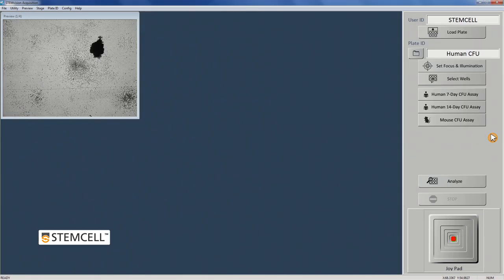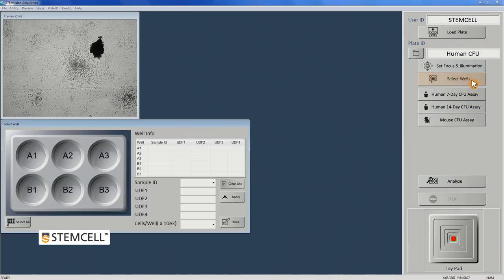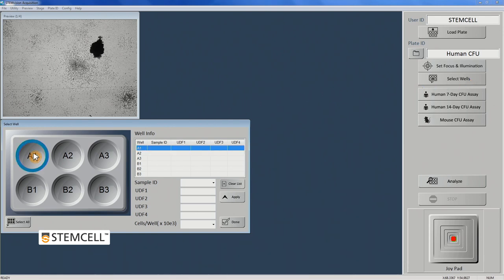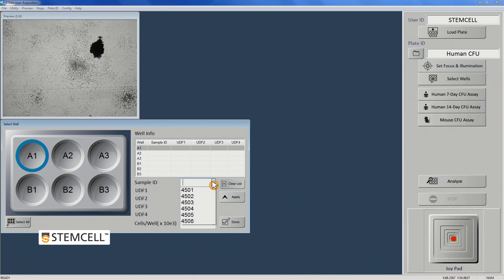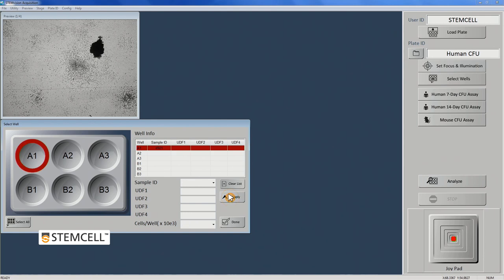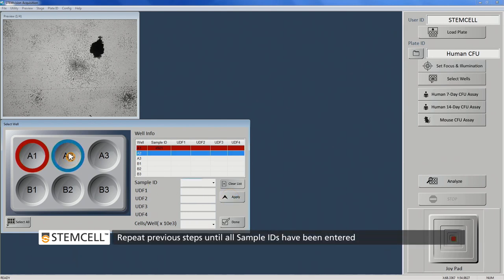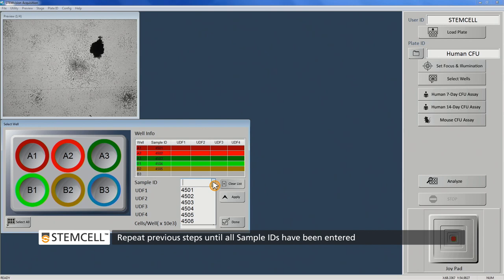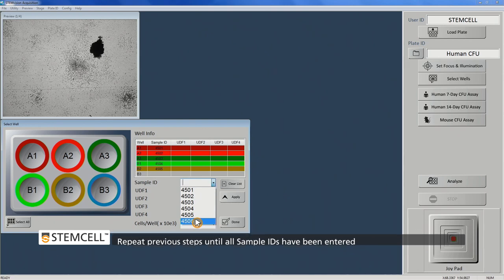Once the sample has been properly positioned, illuminated, and focused, click Select Wells on the control panel. Select a well and pick the correct ID from the Sample ID drop-down menu. You can either pick a previously defined sample ID or enter the information manually. Click Apply when done. Repeat the previous steps until the appropriate sample IDs have all been entered into the well info table and click Done.